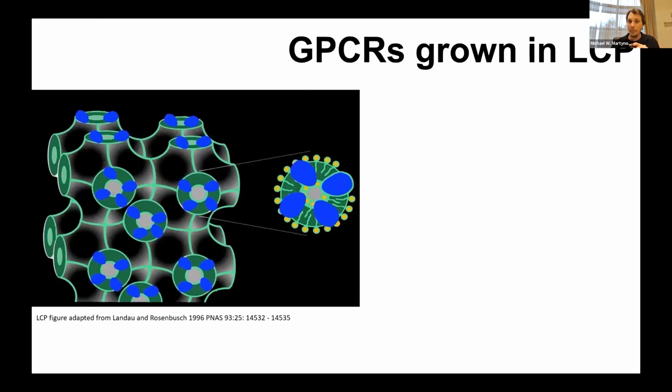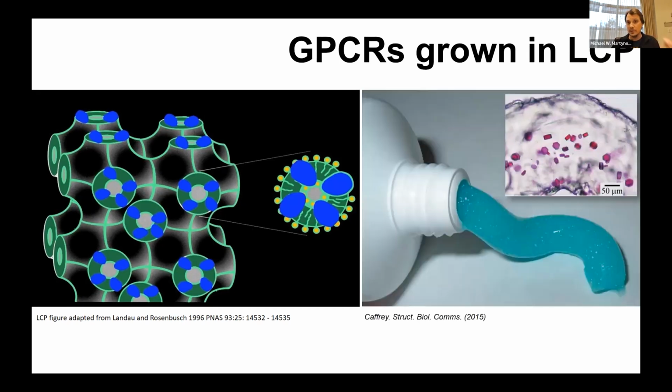And so what we do is we mix lipids from a membrane together with the protein, and we pray that they form crystals. What does that actually mean to you as the person trying to do an experiment, or if you care and want to do a micro-ED experiment of your own? We're basically growing crystals in toothpaste. So try and imagine putting this toothpaste onto your TEM grid and trying to get it thin enough to determine a structure. That's extremely challenging.